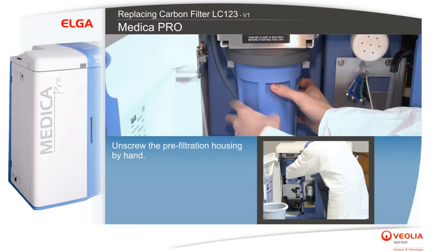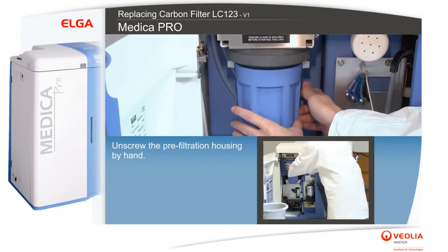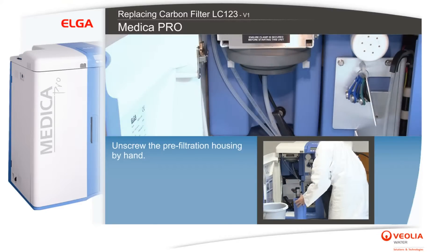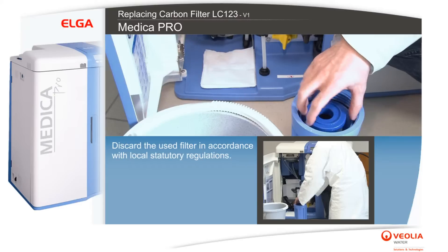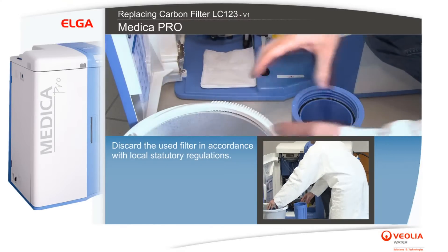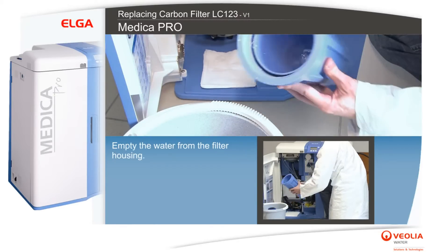Unscrew the pre-filtration housing by hand. Discard the used filter in accordance with local statutory regulations, and empty the water from the filter housing.